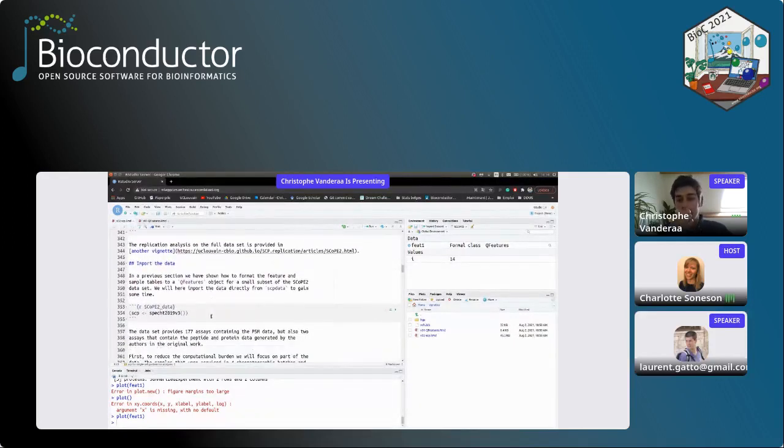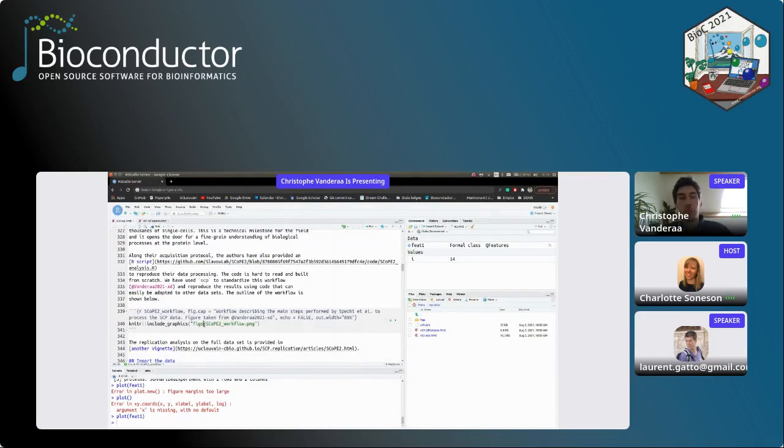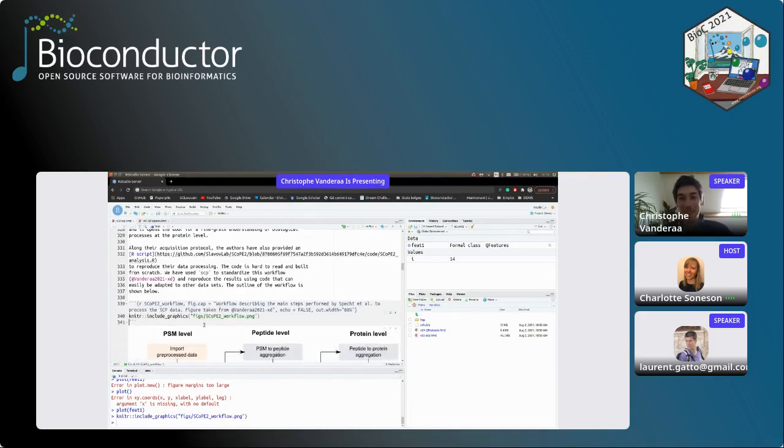Christophe, I just added a poll to check whether people are up and running on the Orchestra RStudio instance, and also to make sure that people don't copy your URL, because then they will throw you out. So make sure to generate your own instance. Don't copy this address. I just deleted it, so people cannot copy it. Okay, thanks a lot for the poll. If you could go to the poll tab and answer, so we know who is not ready. Looks like we have 8 yeses and no nos. Okay, perfect.